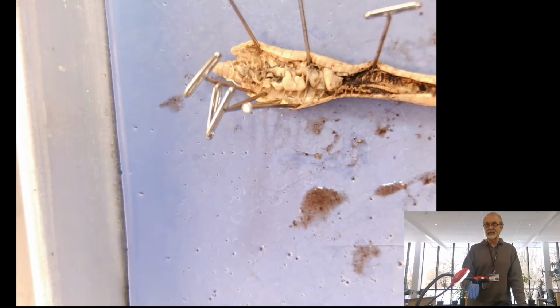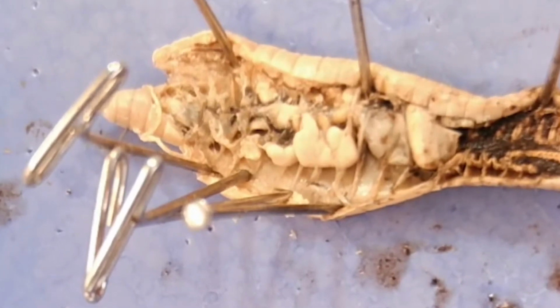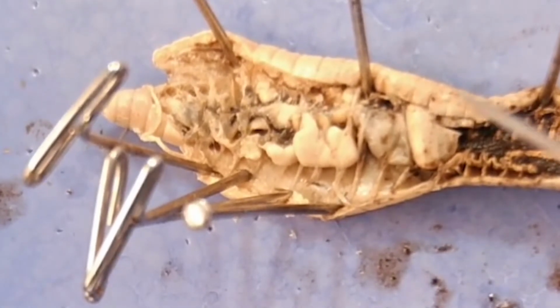And again, as they break down that organic matter, then it becomes available to other organisms in a somewhat more reduced or digested form that they can be able to utilize. Now I'm going to lean over here a little bit.